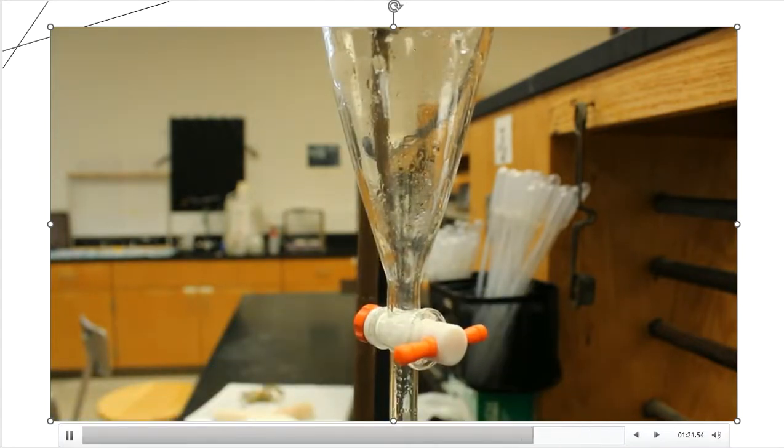So I've got these two solutions now, and out of these two solutions, I'm then going to have to do another step, and that step is with the methylene chloride layer, I'm going to add 3 molar sodium hydroxide. So that's our next step.